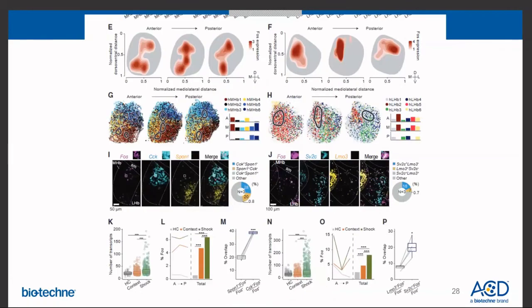And they go on to do some really cool things. They further characterize neurons in this complex. They use RNAscope probes to show transcriptionally defined populations that respond to aversive stimuli. It's an impressive resource. To do it justice, I'll just refer you to the paper itself. The methods are descriptive and easy to follow.